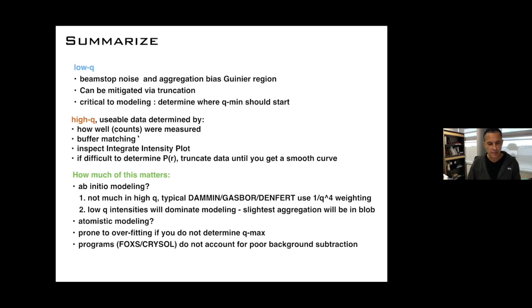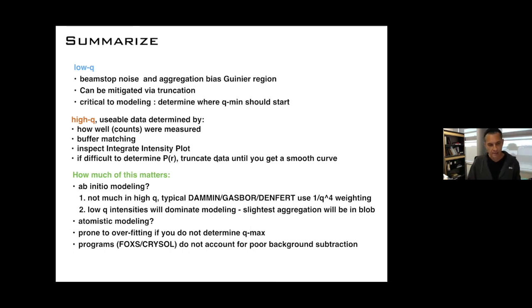One way to look at high-q quality is to inspect the integrated intensity plot. Also, when determining the P(r) distribution, if you're having a lot of difficulties and have to truncate data, that's informing you that your high-q data is corrupting the analysis and you should probably exclude it.